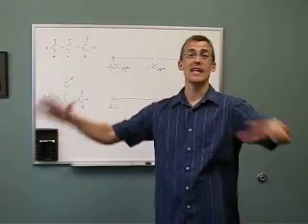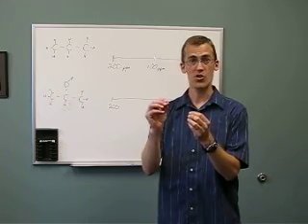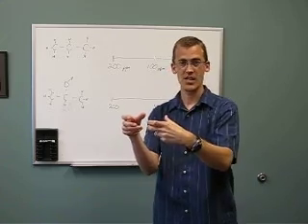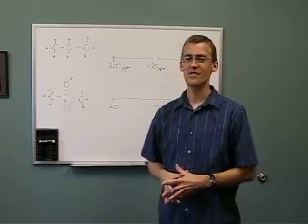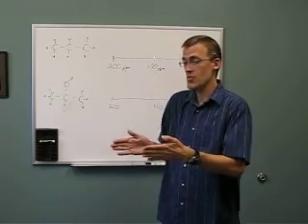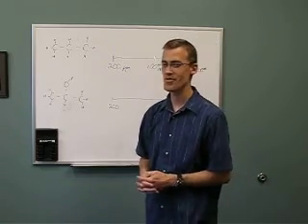The large magnet has a big, powerful magnetic field. All the nuclei have their own electromagnetic fields, and they'll all line up. So inside an MRI, although you don't feel it, it doesn't feel painful at all, your nuclei are actually pointed and spinning the same direction, which is pretty incredible to think about.